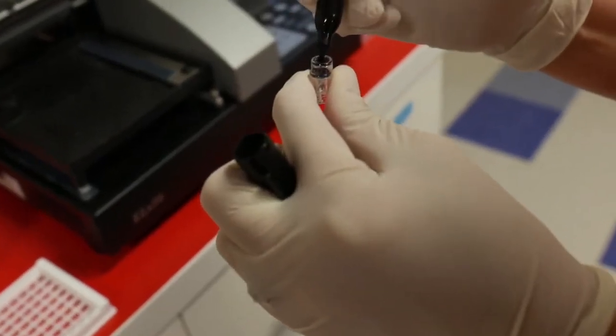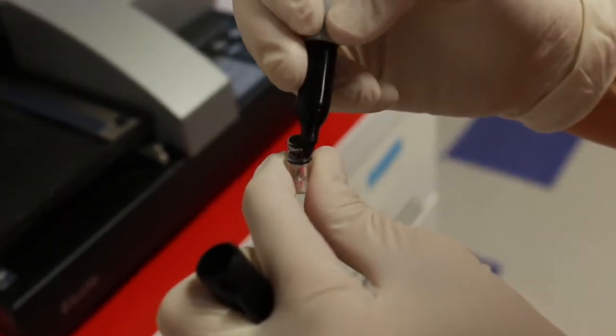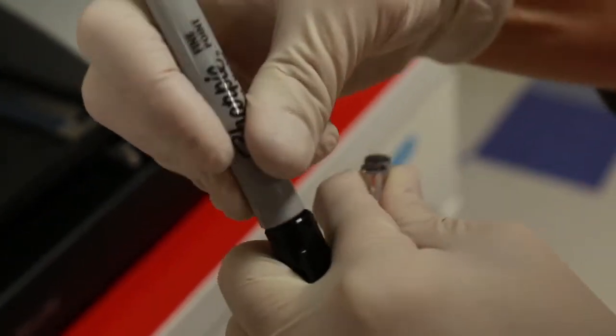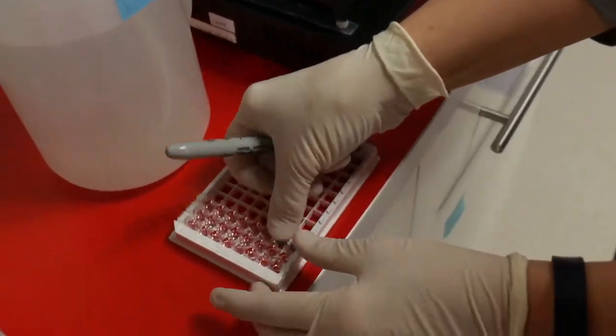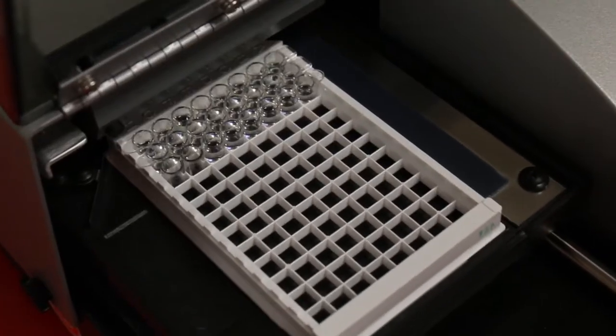You can color these used wells with a Sharpie and use the retained strips as filler for automated washers in future assays.